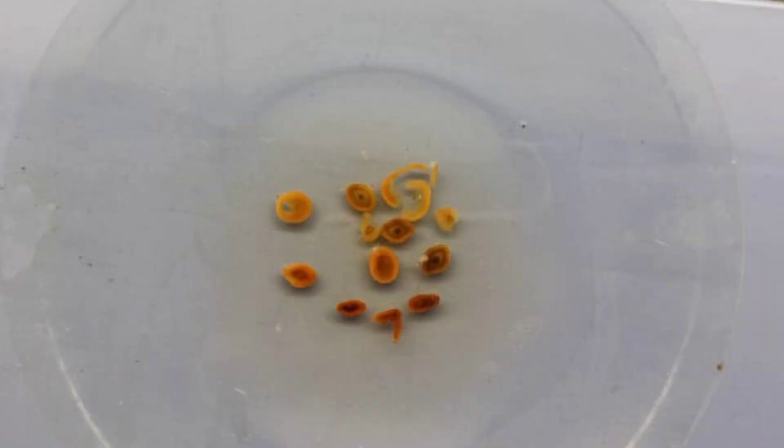Now collect the thin section samples in a watch glass and add Fluoroglucinol and Concentrated HCl. Observe under 10x microscope.